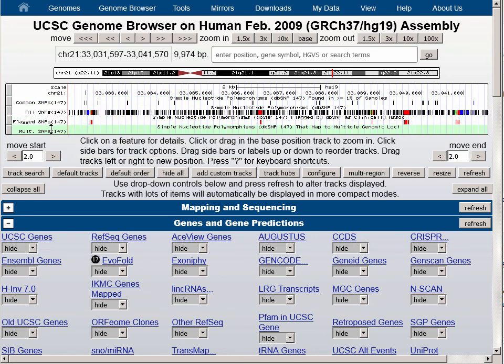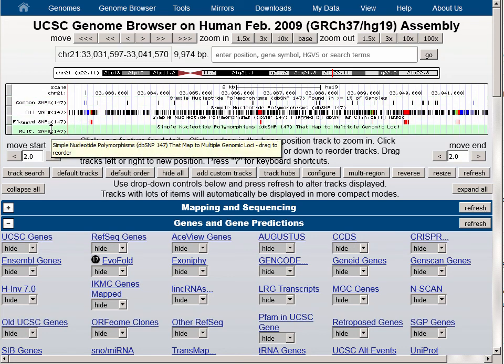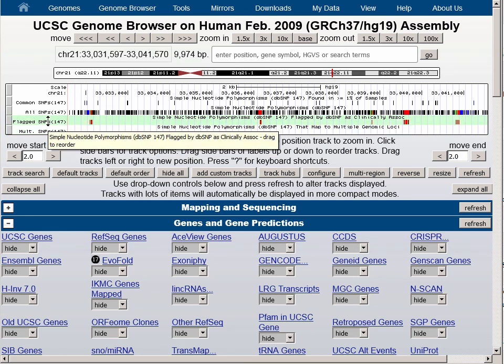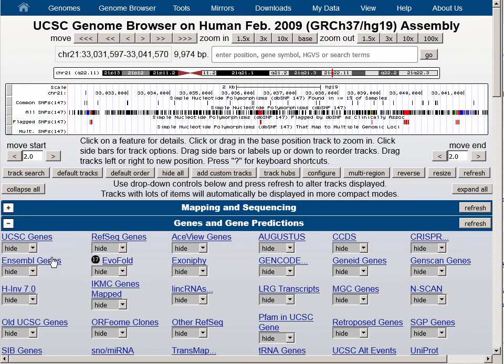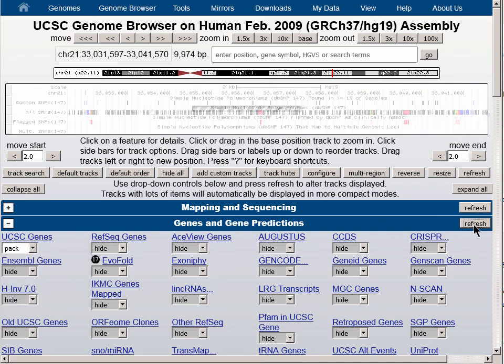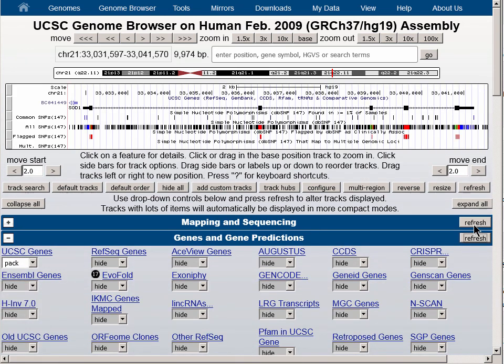You will notice that in this region there are no multiply mapping SNPs, and that flagged SNPs are represented in little clusters of red. When we turn on the UCSC genes track, those SNPs line up with the exons — in this case with the SOD1 gene, which is the default location for the HG19 assembly.